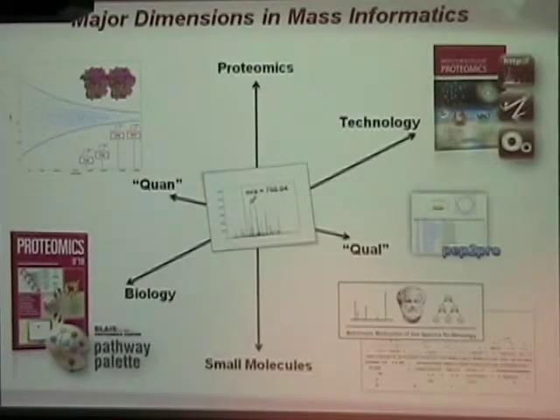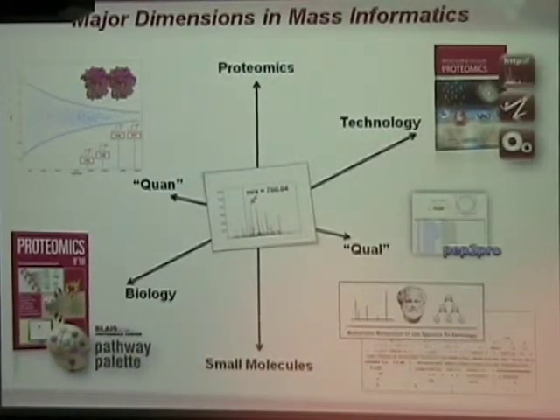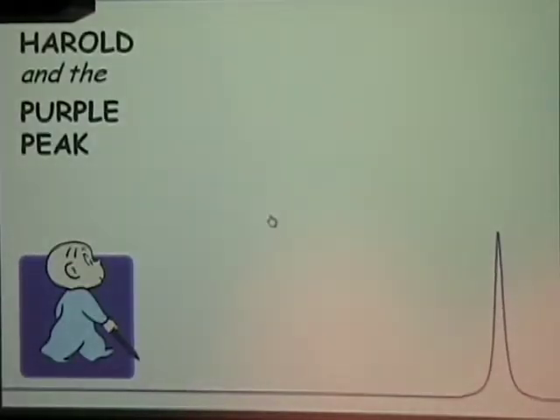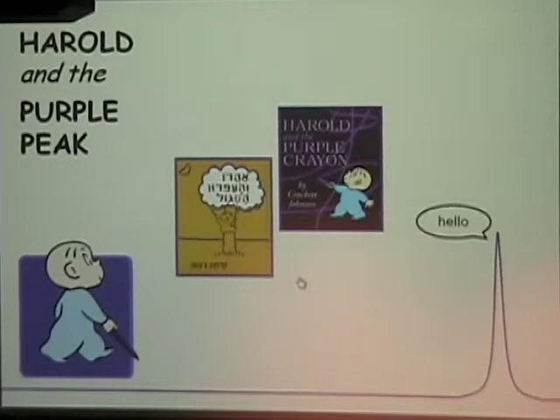So just to calibrate, how much of the audience knows the distinction, say, between an MS1 and an MS2? Are you all comfortable? Yeah, okay. What I'm really tempted to do is the mass spec refresher, which I always have ready, going over things really back to the basics.